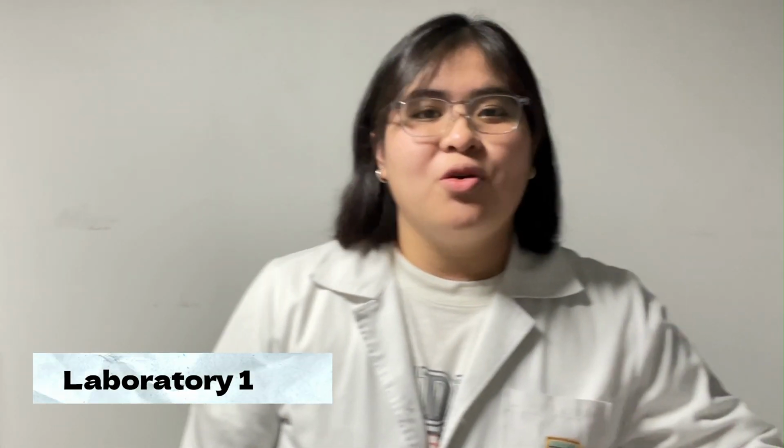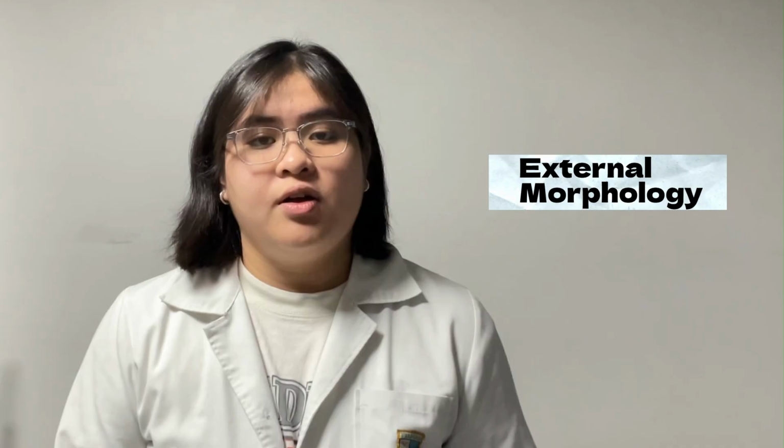So what better way to learn more about them than through photos, right? This first lab activity will be the starting point for all the lab exercises that follow, because it focused on the external morphology of insects and how each physical part contributes to their function, lifestyle, and their survival.